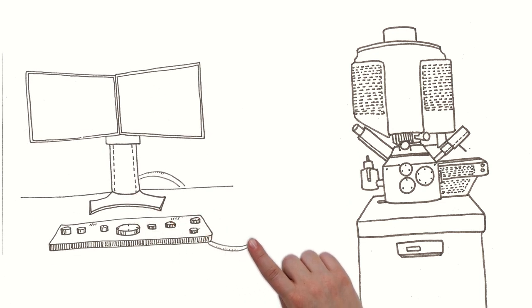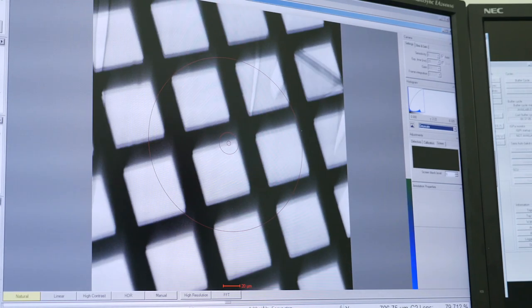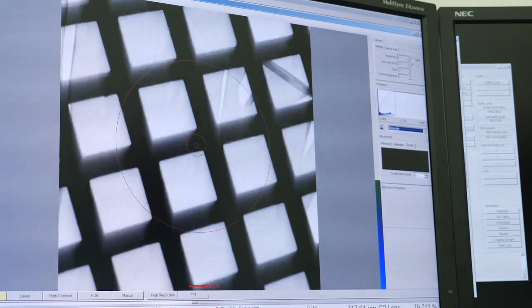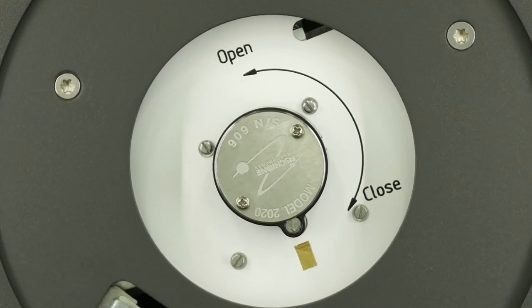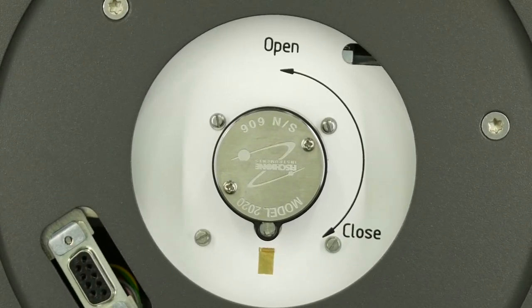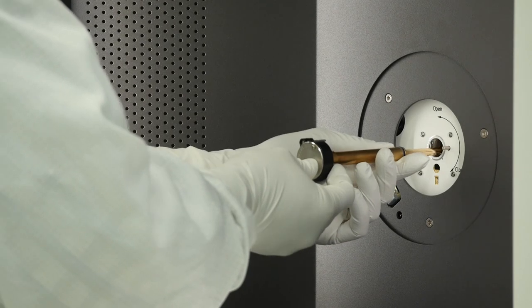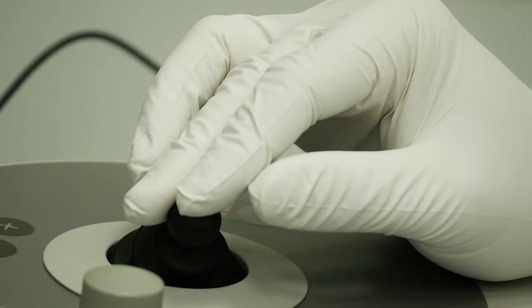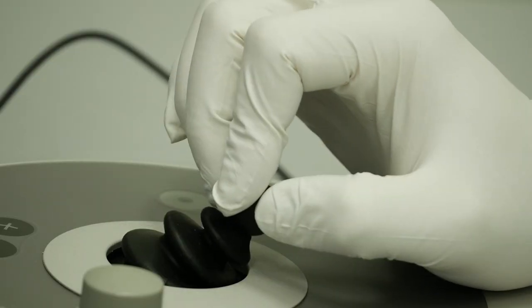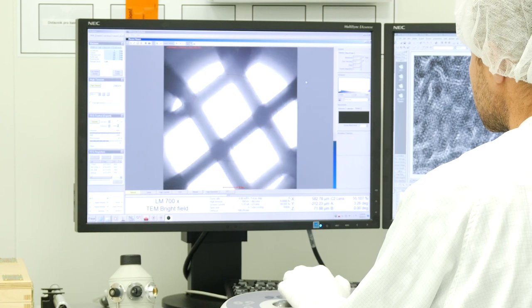As soon as the electron beam hits the sample or scans through it, various detectors placed in the microscope create the final image. And can I manipulate the sample placed this way in the microscope? You are right that it is not enough to move most of the examined objects along a horizontal axis. Information can be gained from various depths of the sample, and we can observe them if we slightly turn the sample. The sample holder in the transmission microscope is inserted through a vacuum interlock in the goniometer. This enables not only movement along the X and Y axes, but also its inclination around one or both axes. Also, the rotation or movement along the Z axis in parallel to the electron beam.